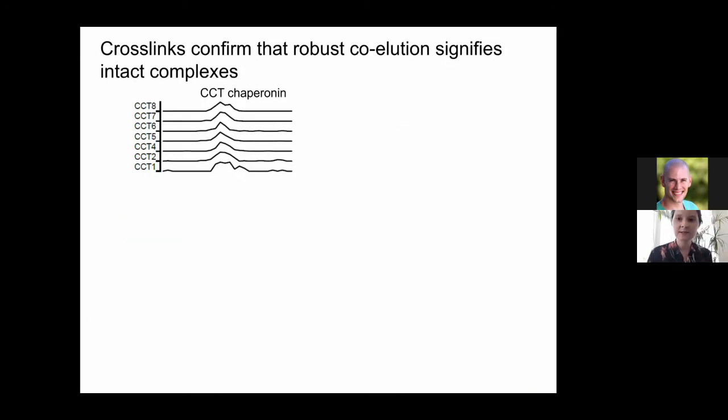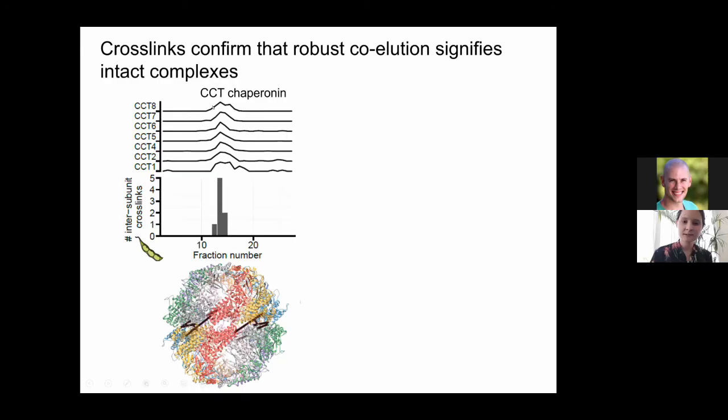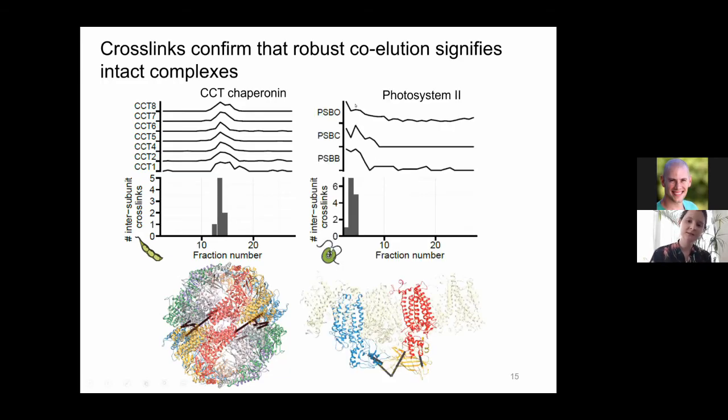We did cross-linking on all of the fractions for some select experiments to show that where we're seeing this correlation of a peak is the same point where we're seeing intra-complex reasonable cross-links. So we did that on soy and also Chlamydomonas. And so here for this portion of photosystem 2, we're seeing the internal cross-links in the solvent exposed area of photosystem 2 in the same fractions.